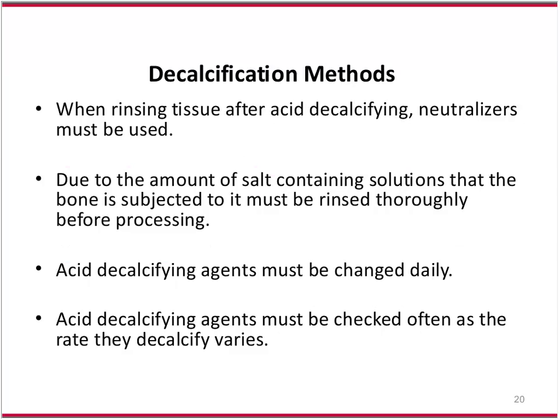So due to the amount of salt-containing solutions that bone is subjected to, it must be rinsed thoroughly before processing. So the salts start maybe in PBS, and then in fixing in 10% neutral buffered formalin. And then you're going to your decalcifying agent. If you use EDTA, there's a lot of salt.